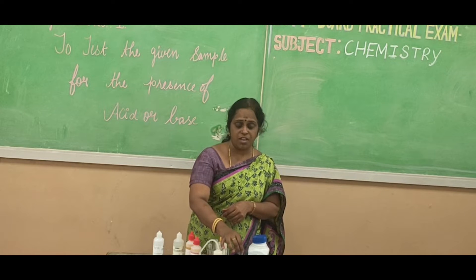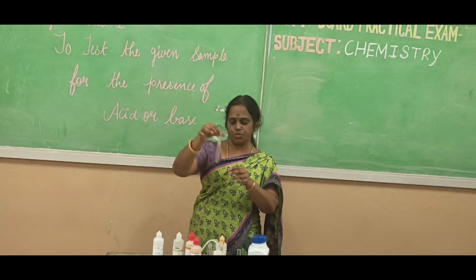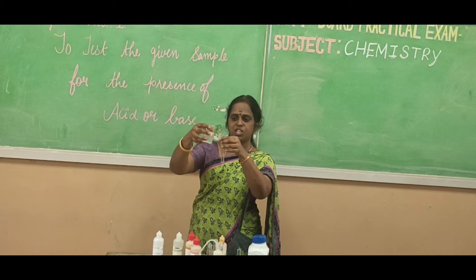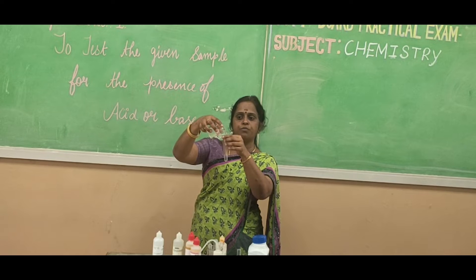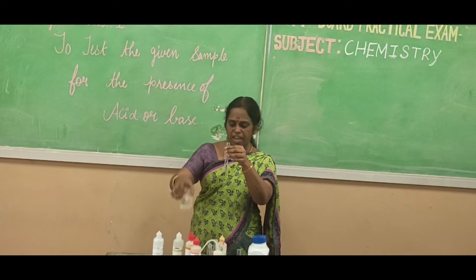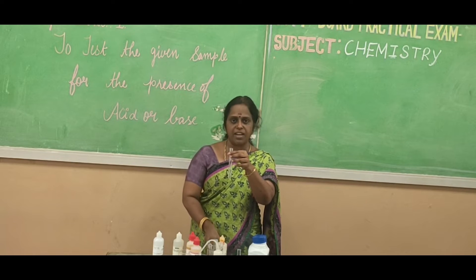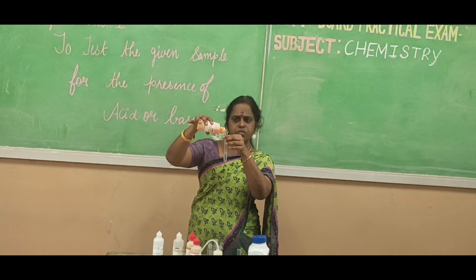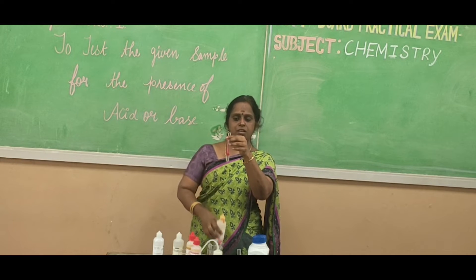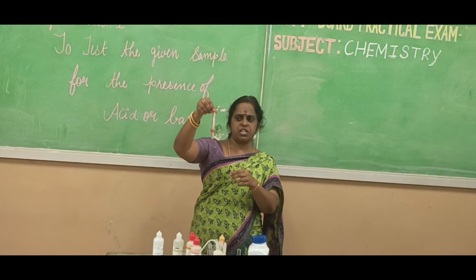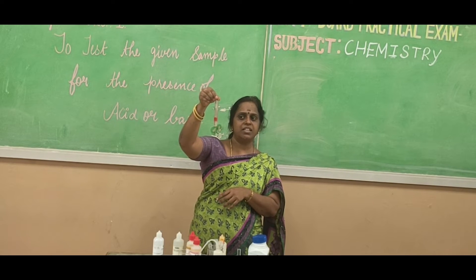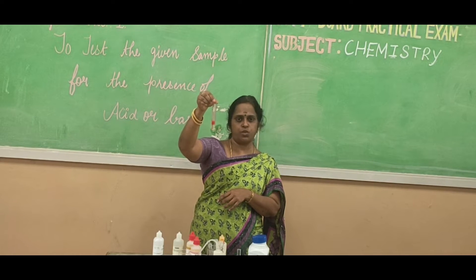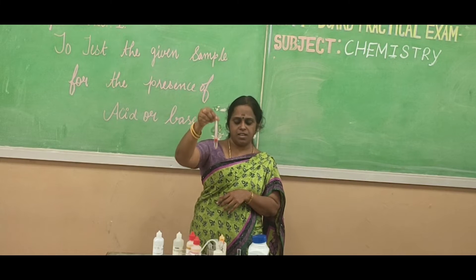Now carry out the second test. In a similar way, take a test tube and add 5 ml of the test solution. To this, add the second indicator — methyl orange. A few drops of methyl orange are added to the given test solution. What do you observe? You observe the solution turns pink in color. This clearly confirms the presence of acid.